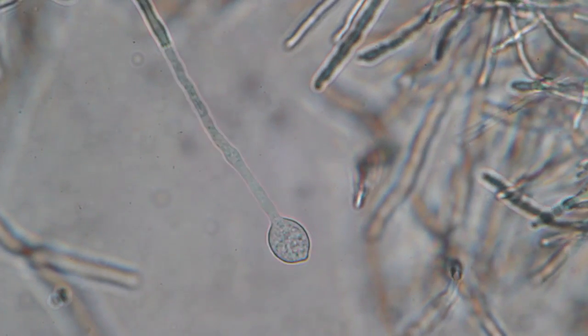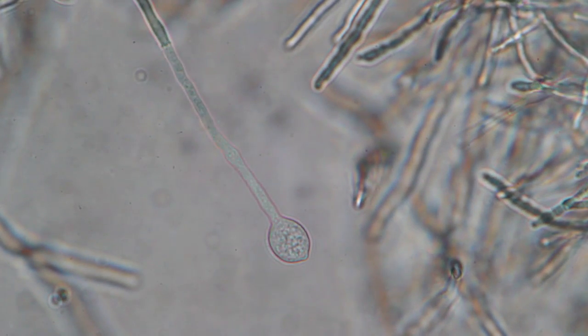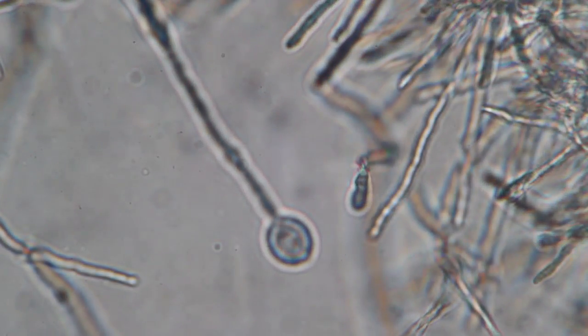Then I found something very interesting. I think this could be a sporangium — they might contain the spores. It was only one of them that I found that looked like that. Otherwise, I did not really know what the significance of this structure is.